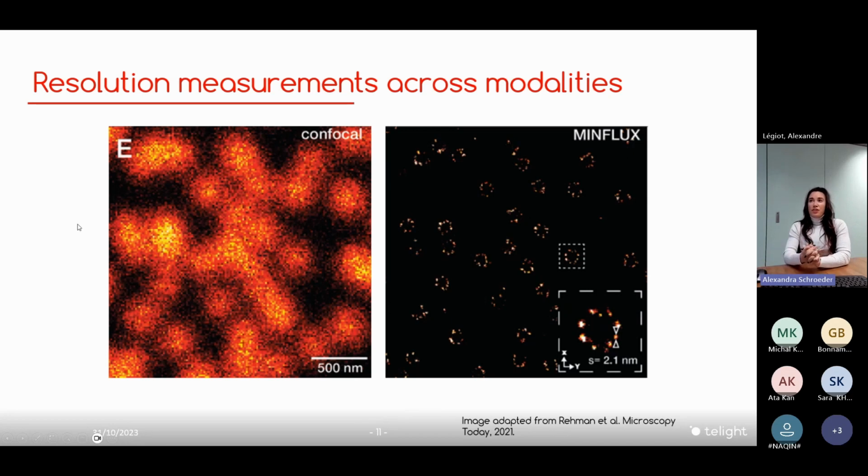Here, I'm going to show you a few images of what the nuclear pore complex can look like across different imaging modalities, considering ranges that span from a confocal laser scanning microscope down to the single nanometer level of imaging with technologies such as MINFLUX. Here, we're seeing resolution near 200 or 250 nanometers, and we're getting down to two orders of magnitude higher. I attended a talk earlier this morning, and the analogy was really great.